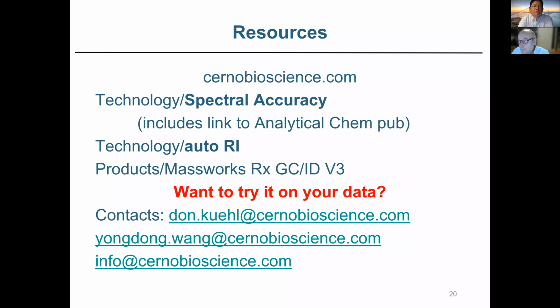Now, if you don't use profile mode data, you won't get accurate mass, obviously, because you need to run profile to do that. But you will get the advantages of deconvolution, and you'll get the advantages of the retention index and the forward reverse search algorithms that help you determine the quality of the match and help you determine if you have a mixture. And so that's new in this software.